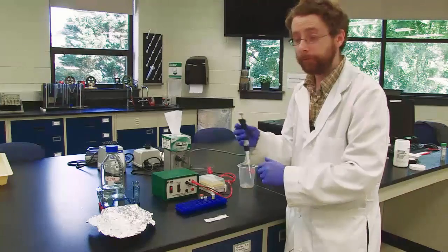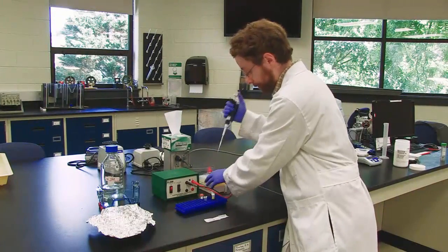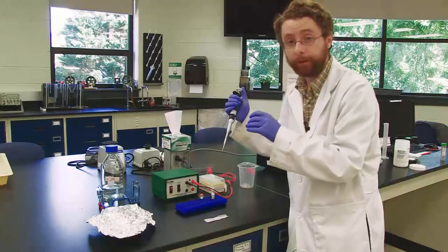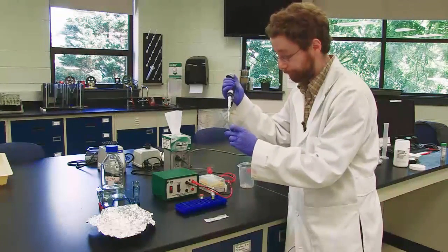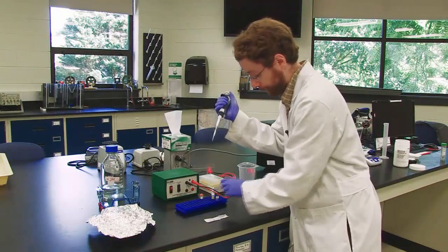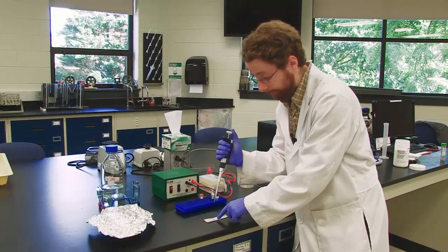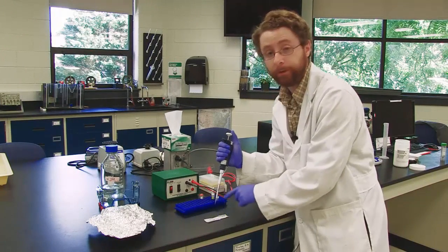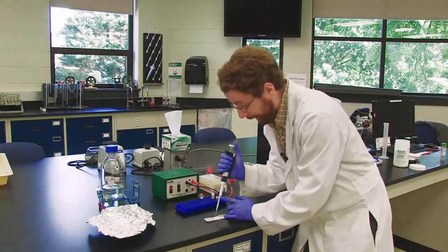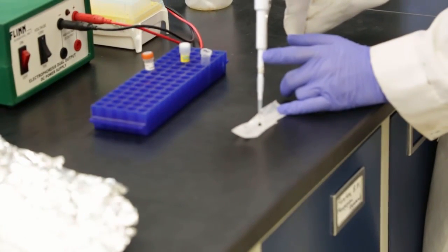My micropipetter is now set to 20 microliters, so I will take my DNA sample. And I'm going to add it to the parafilm where I just placed the loading dye. And I will mix by pipetting up and down.